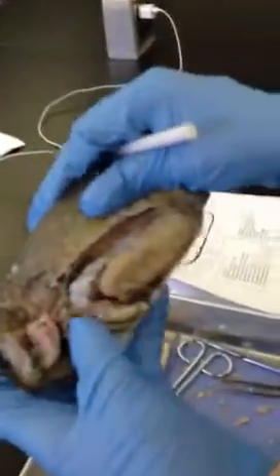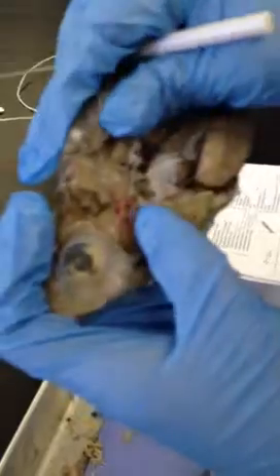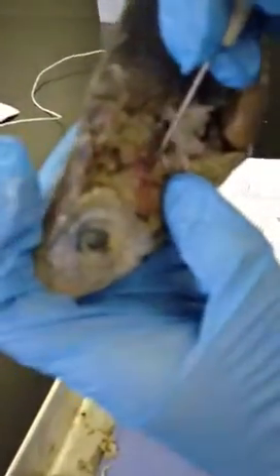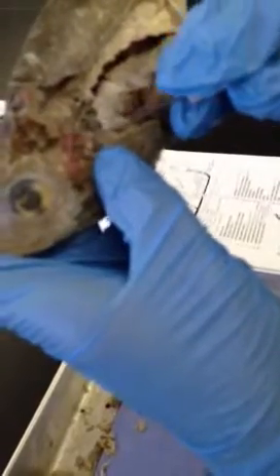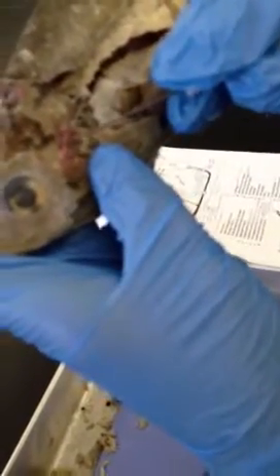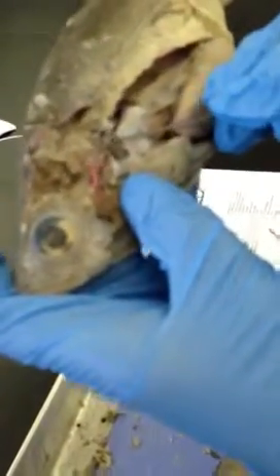After that, this is the air sac, like we said. One thing that we didn't say about these efferent veins are the radix. We didn't mention the radix. This is the radix. So the right radix and the left radix, correct? Yeah. And the radix goes into the dorsal aorta.